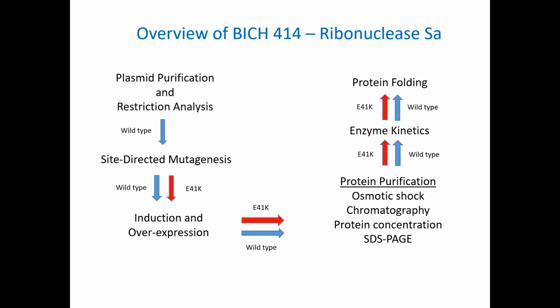Purifying the proteins using osmotic shock, chromatography, concentrating the protein, using SDS-PAGE to analyze the steps of our protocol. And then we'll go on to enzyme kinetics to study the activity of the proteins and how altering a single base to alter a single amino acid to change charge might affect the activity. We'll also study protein folding to see the effect on there.